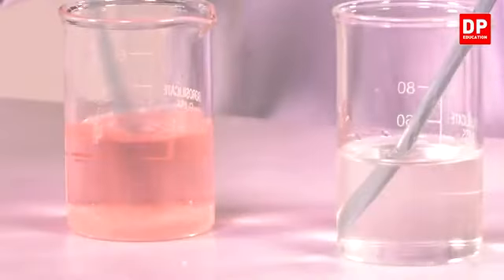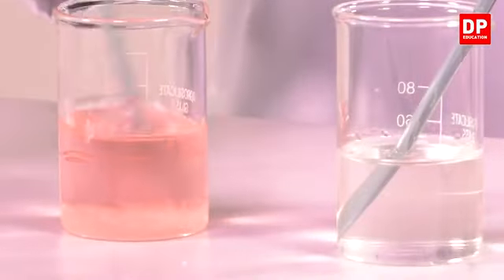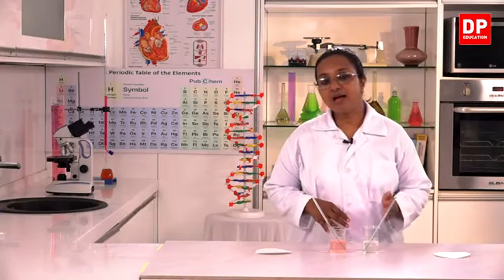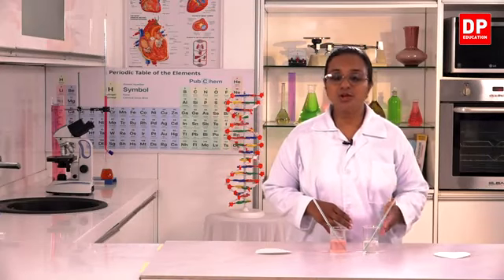So from this observation, you can see the solid sugar crystal still remaining here.